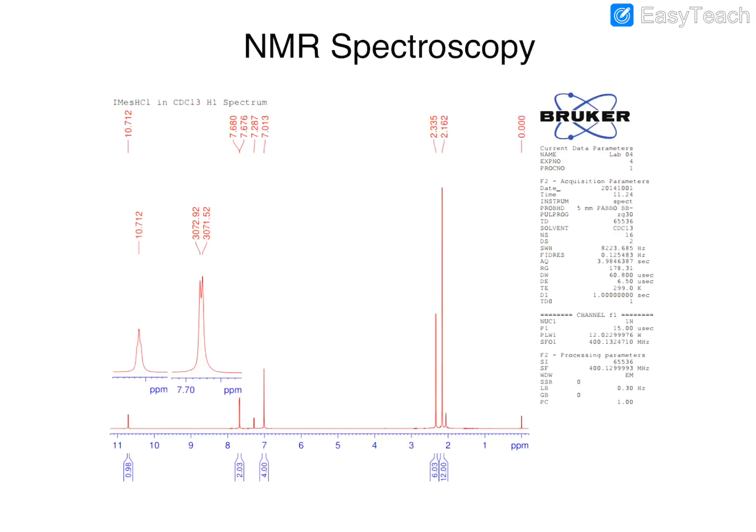What we've mentioned earlier is also the reason why, whenever you're operating at higher field strength so that you can get good resolutions, usually to observe the splitting pattern you need an expanded version near that particular frequency where you want to observe the splitting patterns.